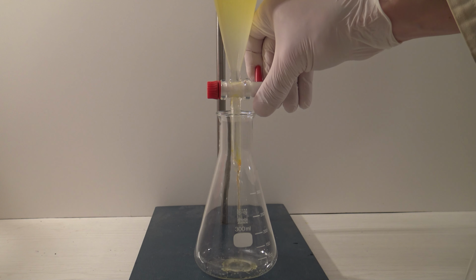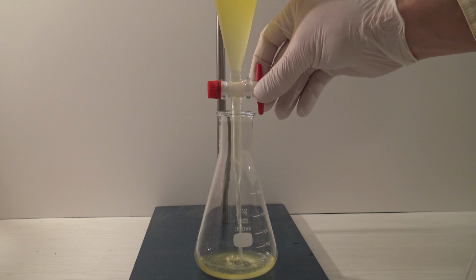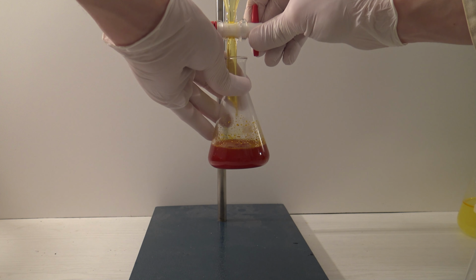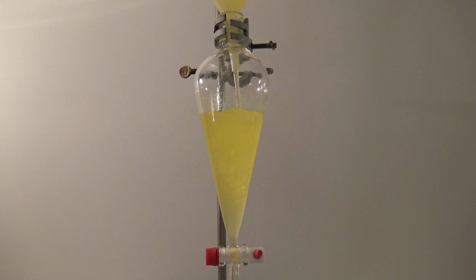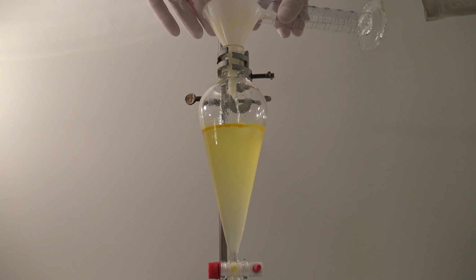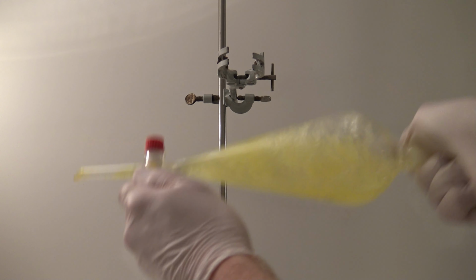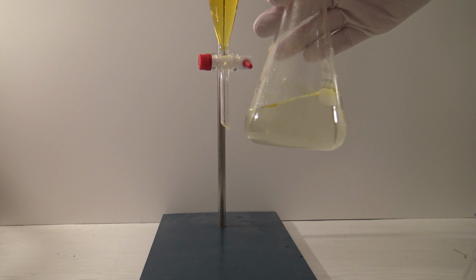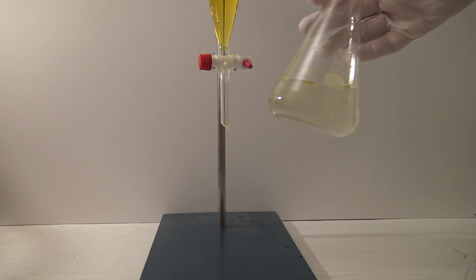The watery layer was added to a large Erlenmeyer flask and the organic layer was added to the other organic mixture. The watery layer was extracted again with 20 ml of diethyl ether because the yellow color was an indicator that it still contains some product. The watery layer was discarded and the organic added to the rest.